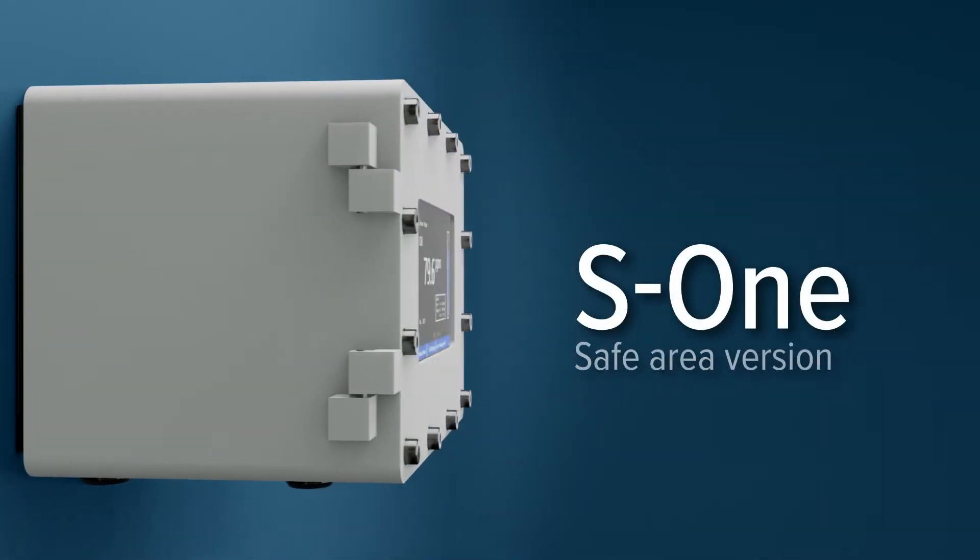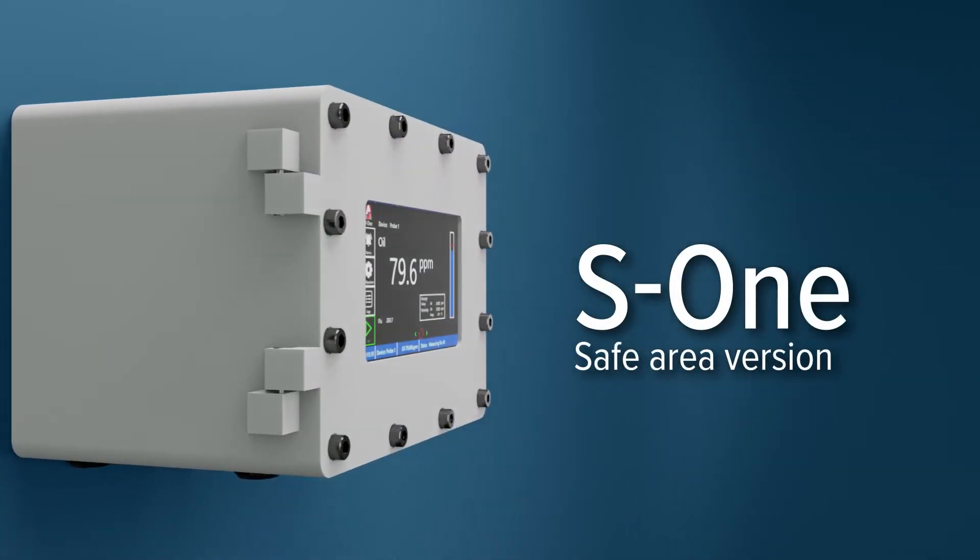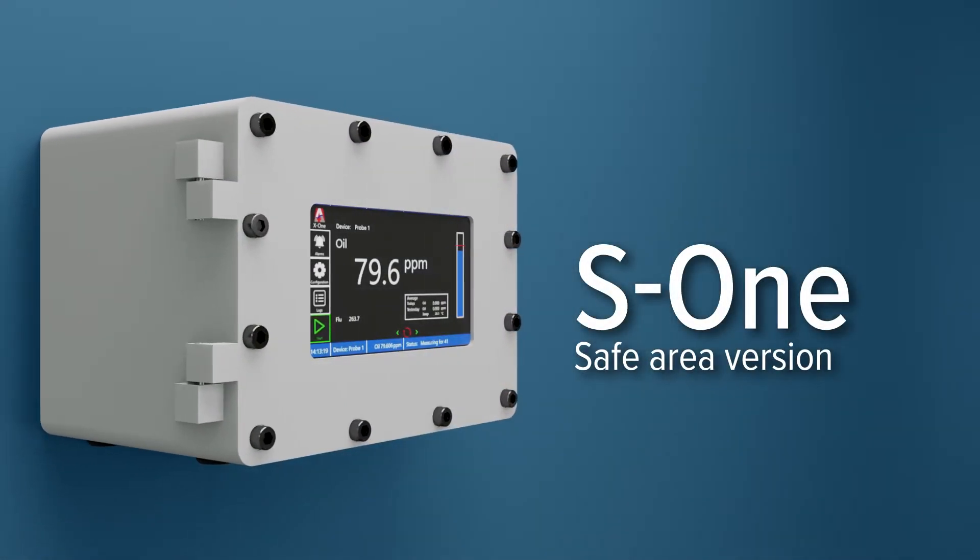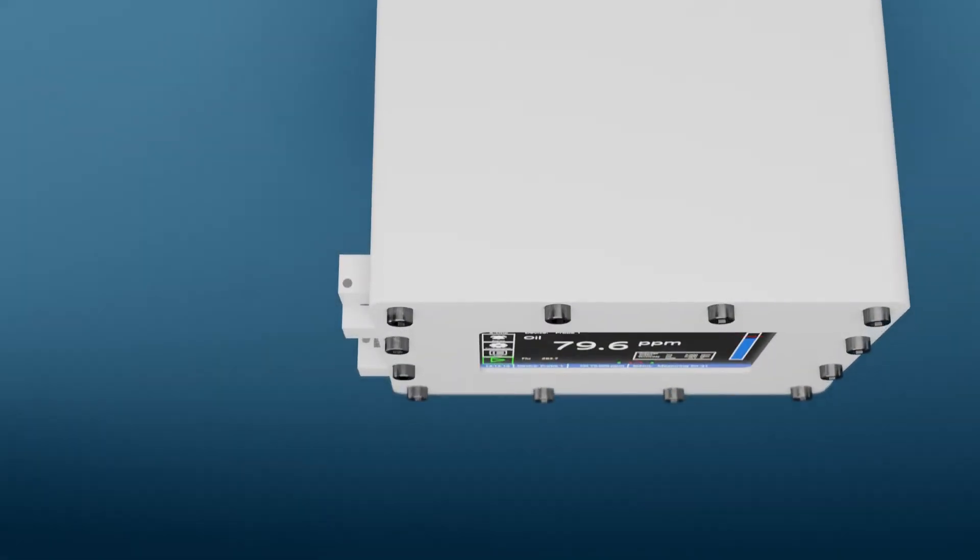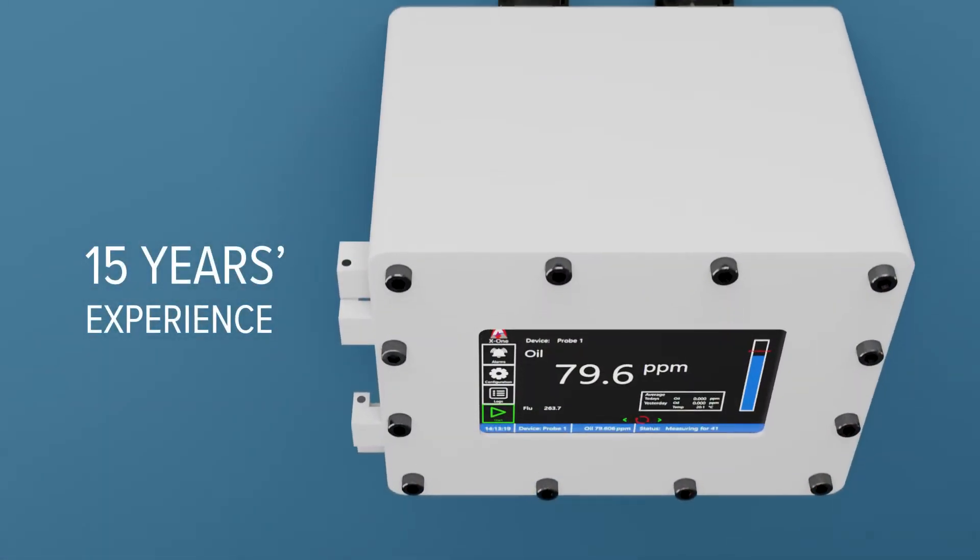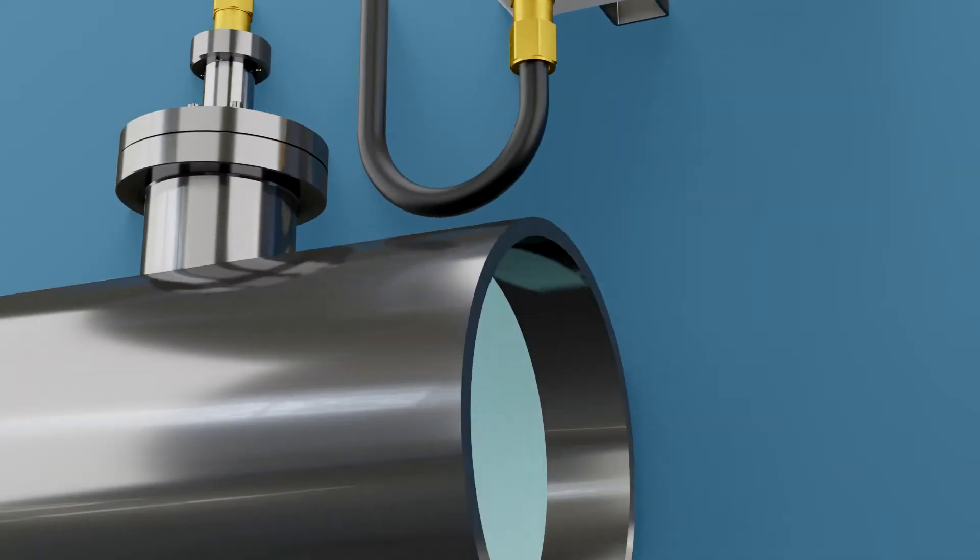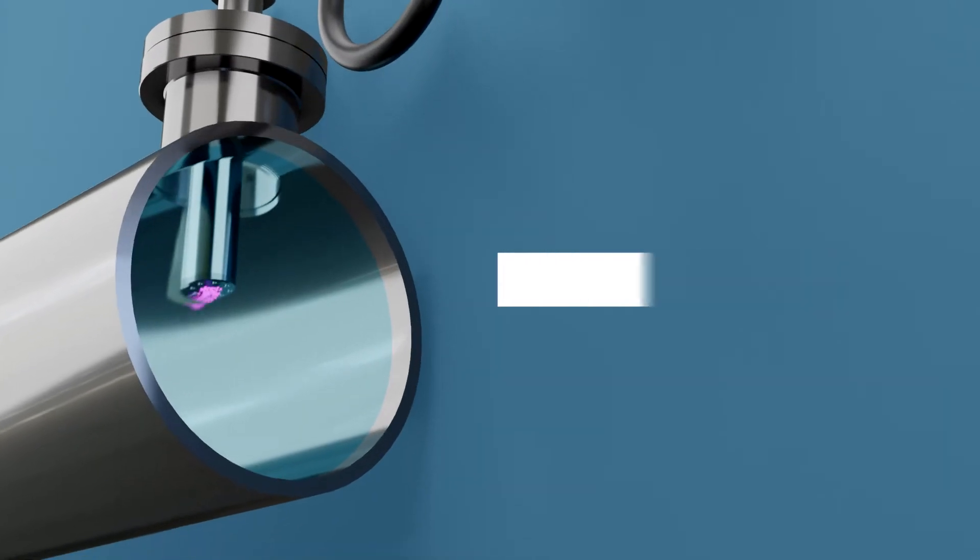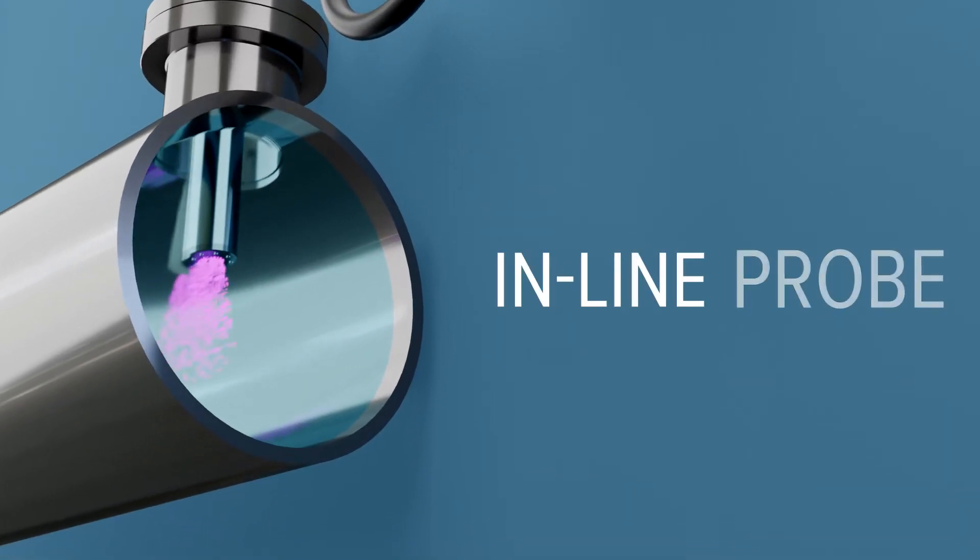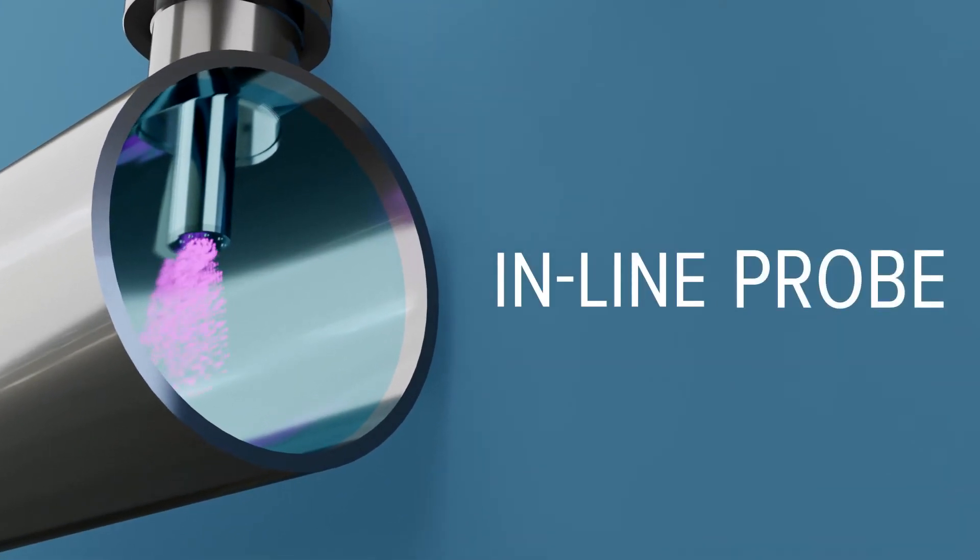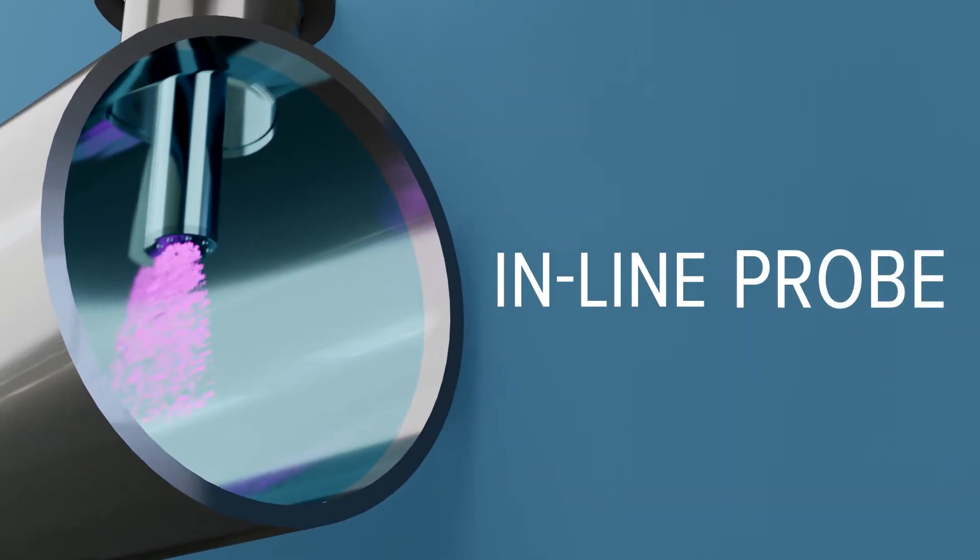The compact, lightweight, and smart oil in water analyzer has been developed with data gleaned from over 15 years of field experience. The X1 uses fluorescence to provide continuous accurate measurements of oil concentrations in water.